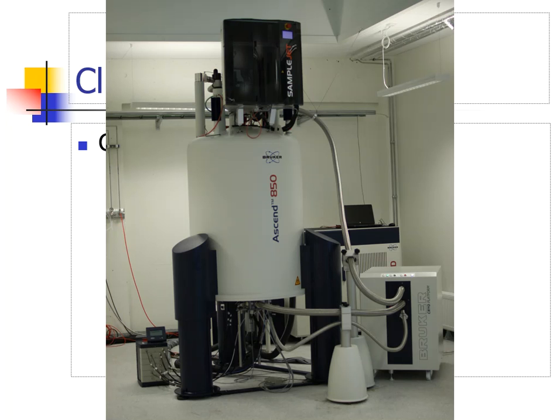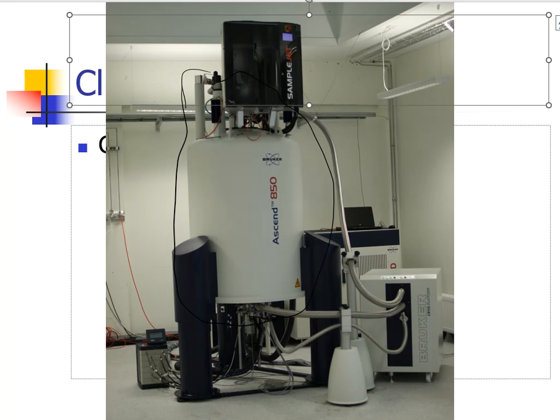So this instrument is made up of a couple of high powerful magnets, and you're seeing these magnets housed in this chamber or this container. And of course, all of the cables down below are meant for different purposes. We're not going to get into that. It's not all about how the machine works and the gears and the mechanisms that get it to do its job. But this instrument does do a job, and that is based on magnets. That's the most important part of this process.